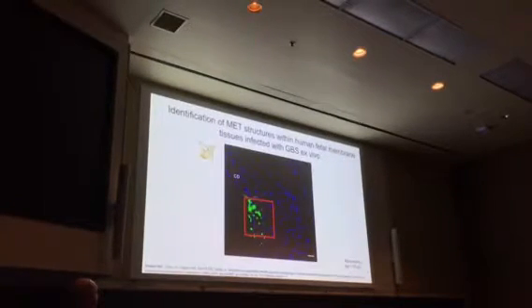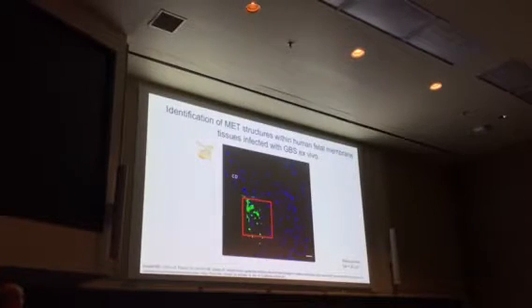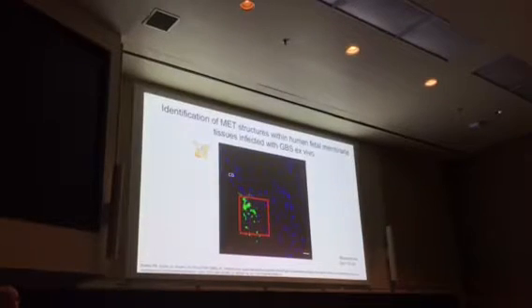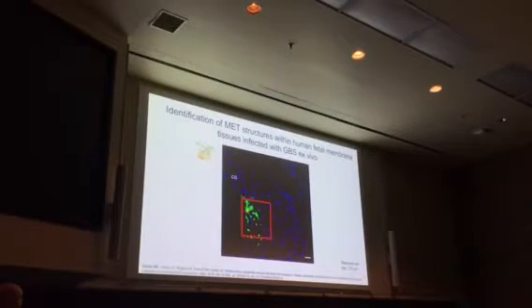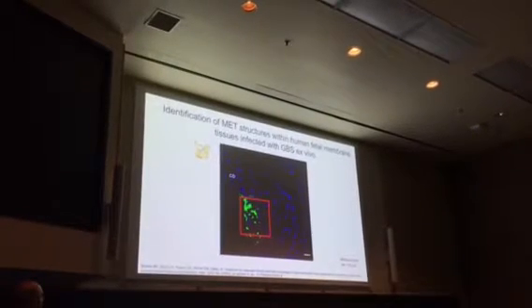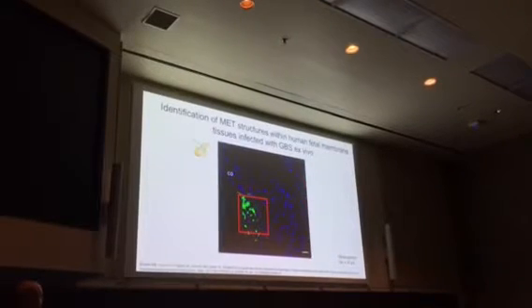And I used a staining strategy that has been used by others to identify extracellular traps within tissues. In blue, we have the nuclei. In green, we're staining for neutrophil elastase, which we've shown has actually been produced by macrophages as well. And then in red, we'll see histones. This is the choroidal surface. The amniotic epithelium would be over here.